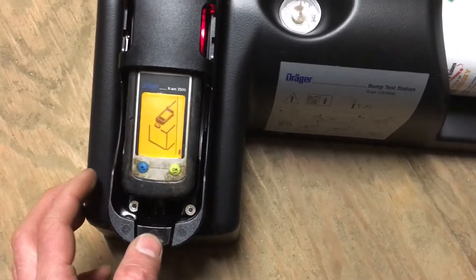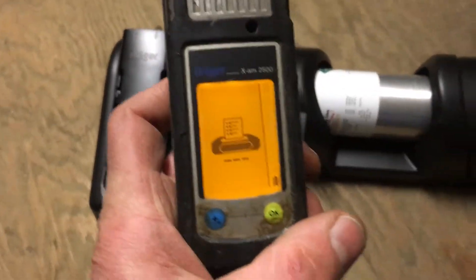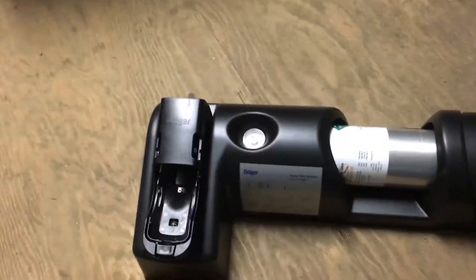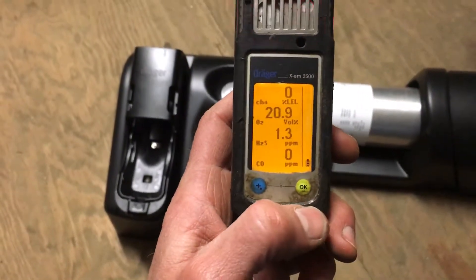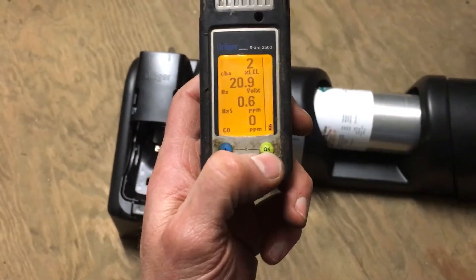That's the signal to pop it out. Go ahead and pull it out. It's going to make a bunch of noise. What I do is wave it around a little bit so it can get some air on the sensors, because it's got to settle down — it still has a lot of gas around the sensors.